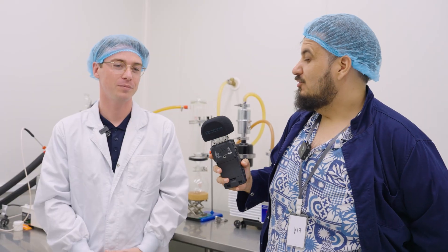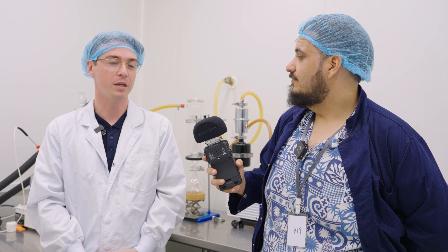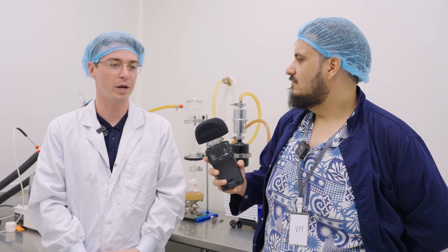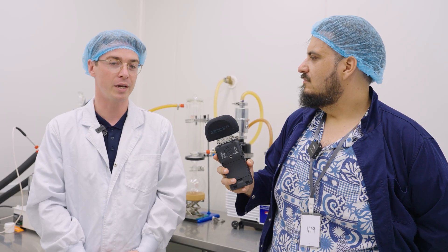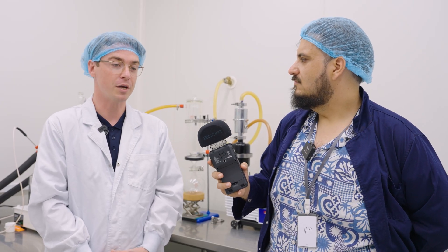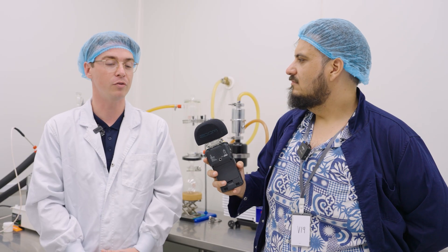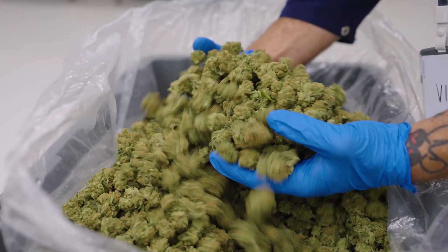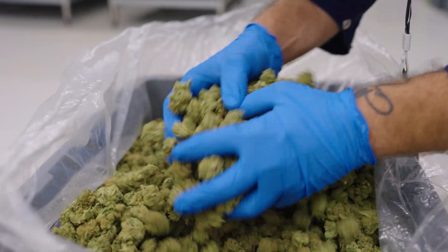How does Superbly Green's commitment to organic impact your extraction process? Significantly. Every stage of the extraction process we try to utilize organic and sustainable methods. For example, the solvent that we utilize is organic. The system itself is closed-loop, so we're mitigating waste streams where we can to be as sustainable as possible. The flower material that we use is organically grown, so at every stage it affects it.